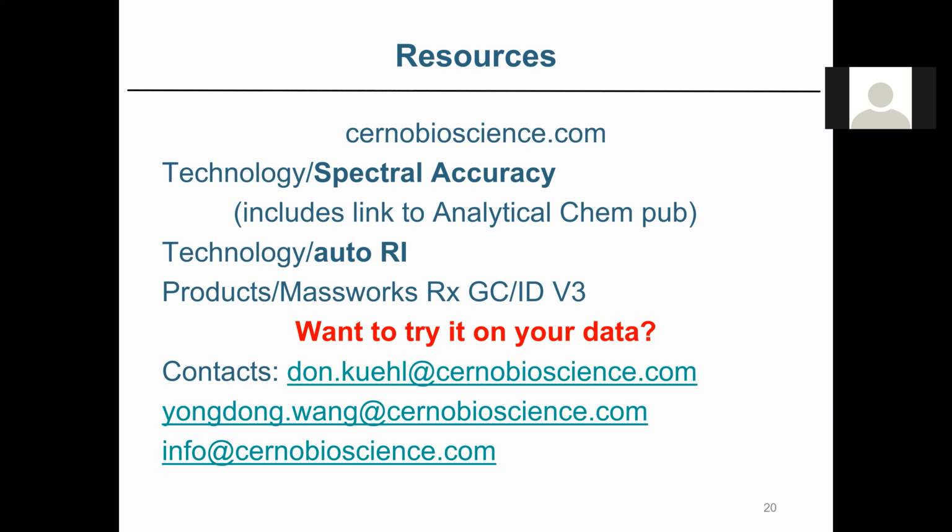Another question from the chat box. Does the PFTBA have to be used in each injection, or no? No. So yeah, good question. Do you have to put the PFTBA in each injection? No. In fact, what we recommend people do is if you run, for example, an external alkane, put it in that one, and that's the only one you need to put it in.